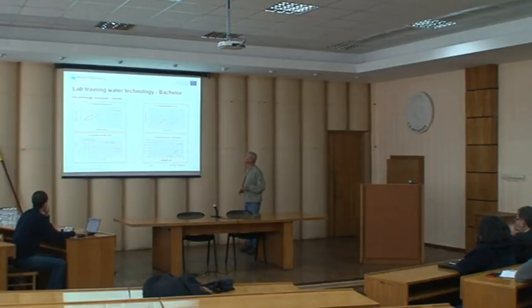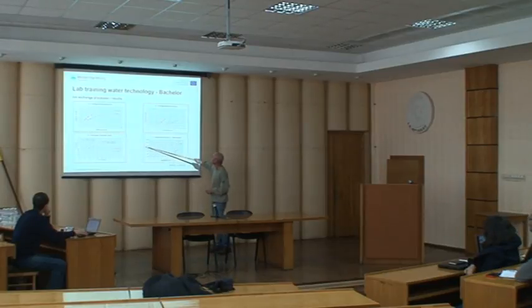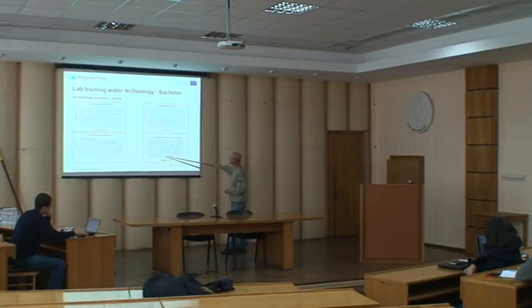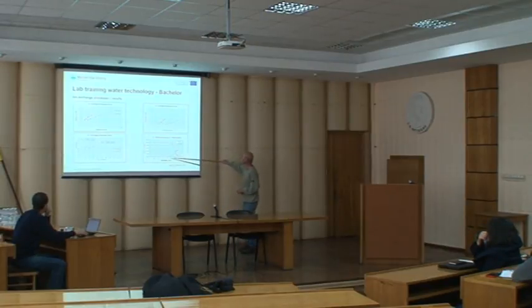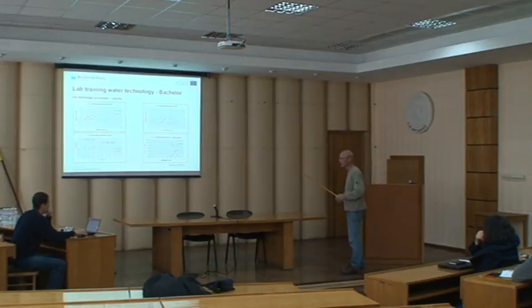So here we have a lot of evaluations. Let me show you this one here. So we have the concentration of H+. This is the operating time in minutes, and this is the concentration of Ca2+, calcium, in the effluent. And you can see that at this point, the resin has to be, what is it called, regenerated, because the capacity is over. Okay.